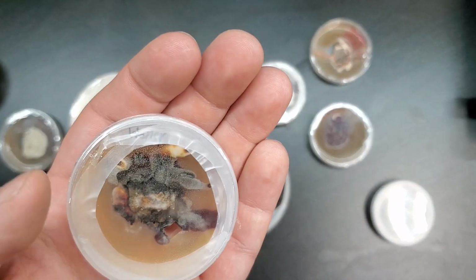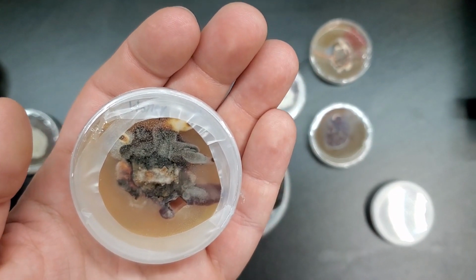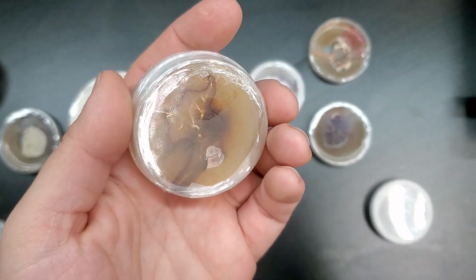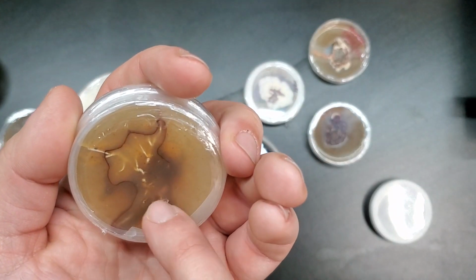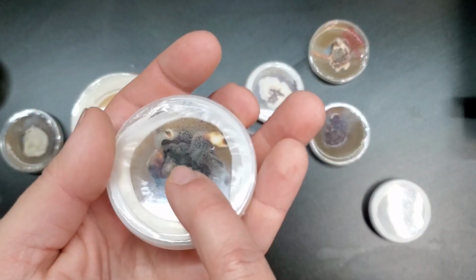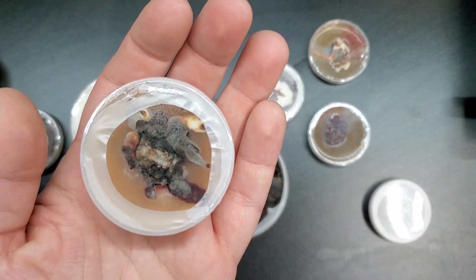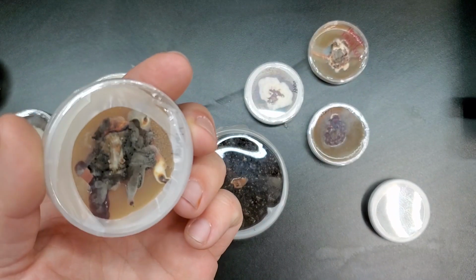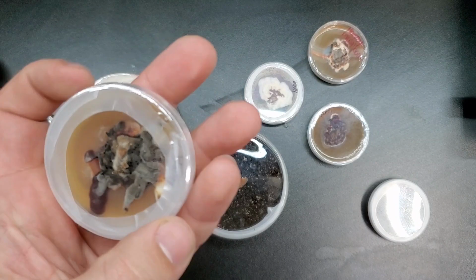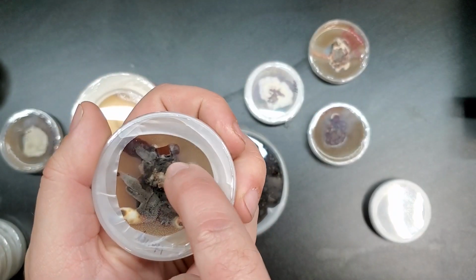But this actually started putting off these really, really strong, thick rhizomorphs that dug down into the agar. You can see it here on the underside. It dug down into the agar, it hit the bottom, and then it actually started coming out of the top of the agar. So this thing was really starting to take off. This is a really good genetic sample of this Armillaria species, at least as far as fruiting properties go. And you can see that I took a little chunk out of here.